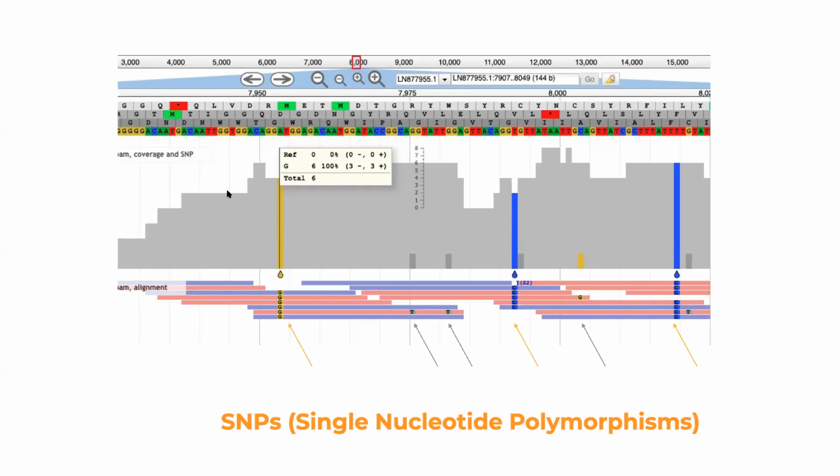For the rest of you, right, so what are these called? These are called SNPs, single nucleotide polymorphisms, okay? They change, and here we have a change that we've identified, and some of them have stronger evidence than others. For example, there's a G right here, there's a T right here, right? But it's only in one read, so it is not significant. So you don't see a sign like this there.